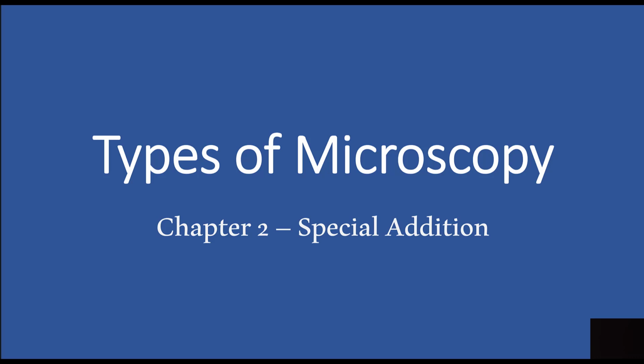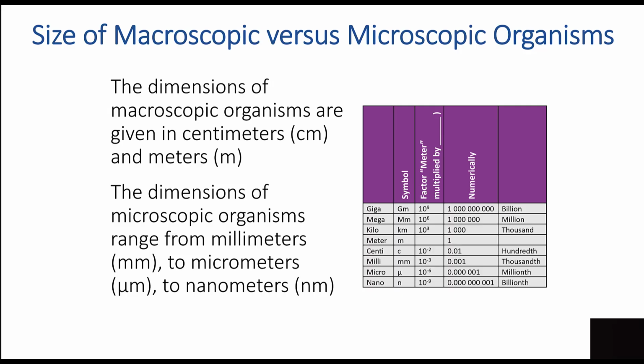This is your host, Dr. V. We're going to go through and talk about the different types of microscopy that you might find in a microbiology lab or in a university setting. It's important to know what's available to you. Many hospitals do, in fact, have higher types of microscopes that we're going to talk about. So I think it's well worth your time.